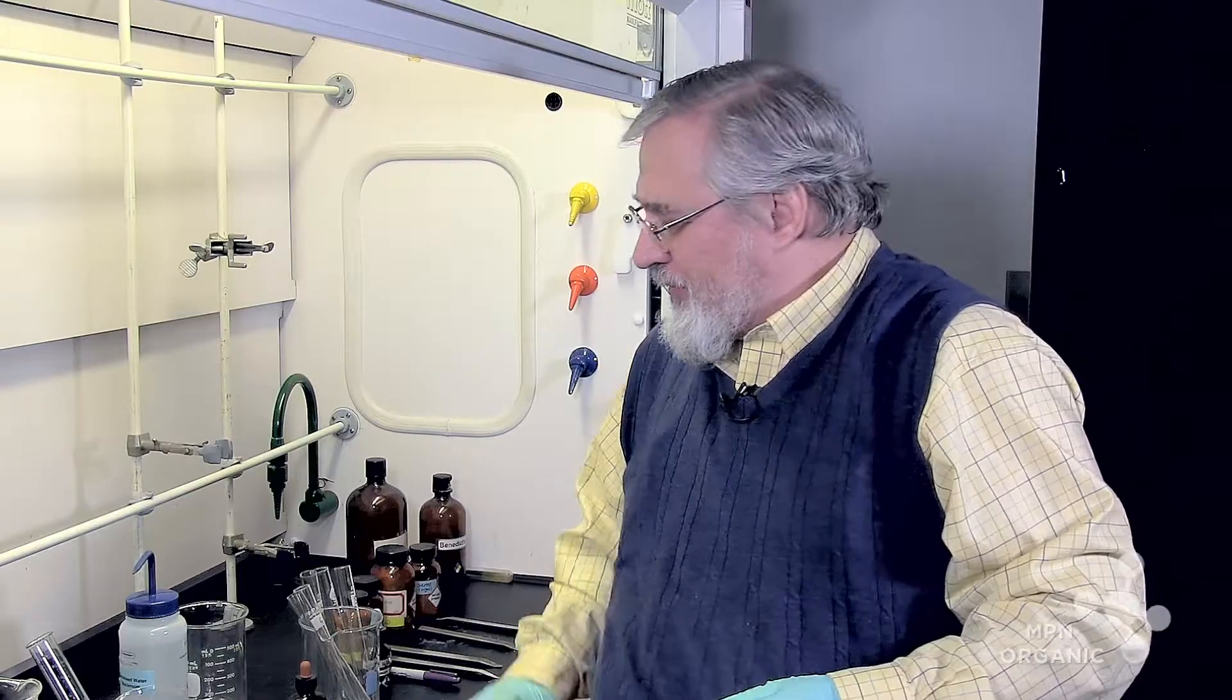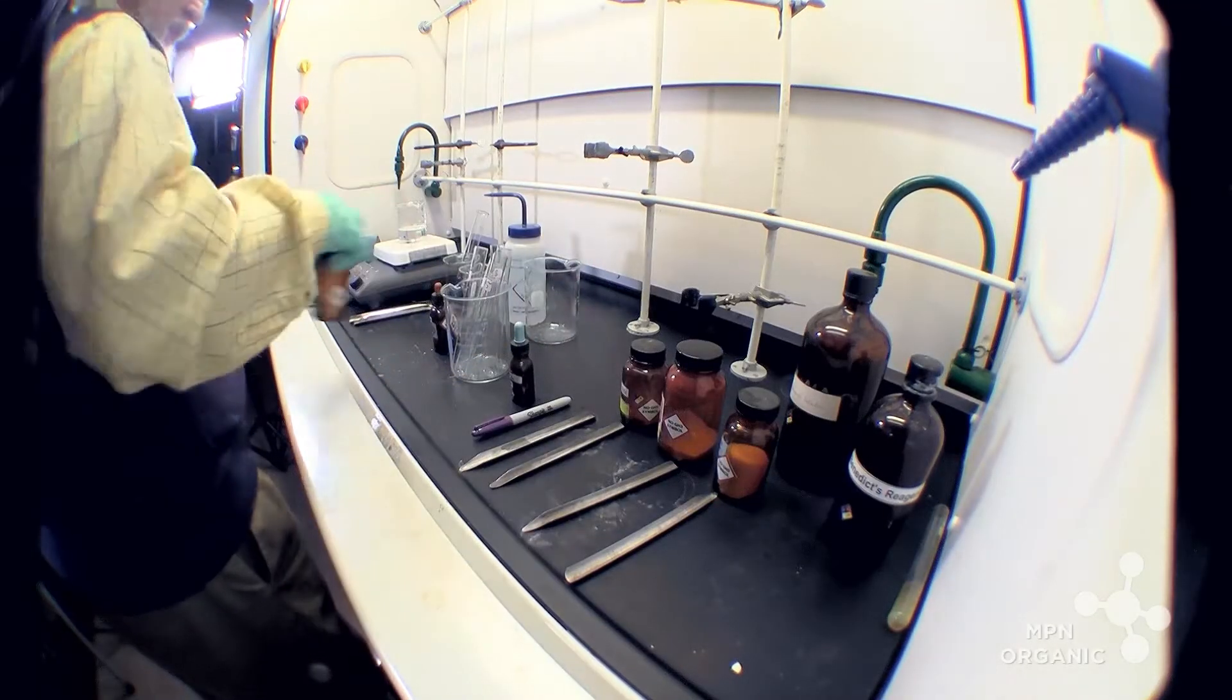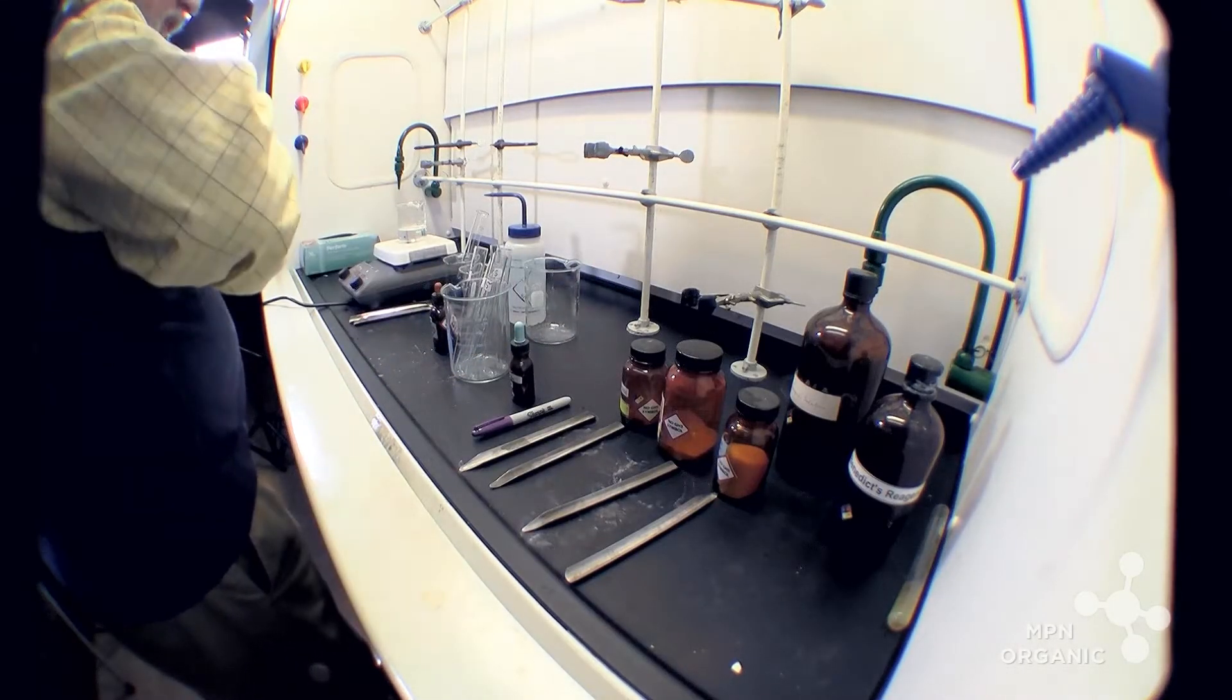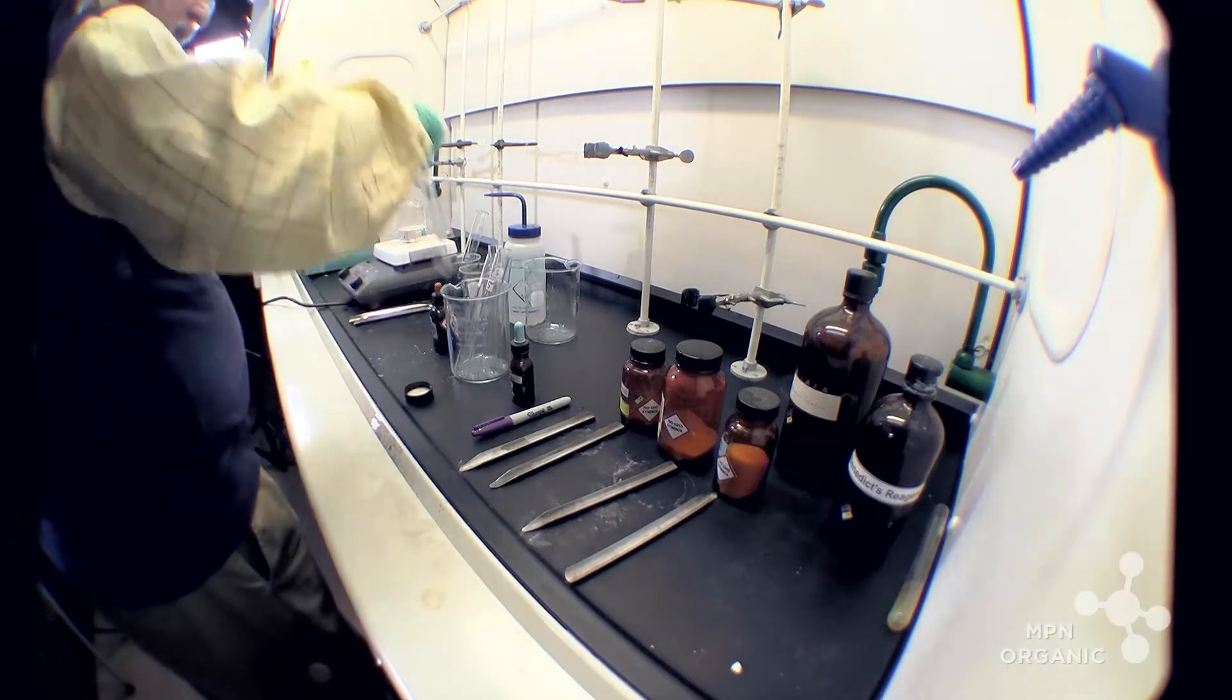We're going to be looking at this property of saccharides and disaccharides which we call reducing sugars. It's due to a structural feature within the saccharide itself which allows the title to be used - reducing or non-reducing sugar. I've got several sugars here that I took off the shelf of the chem department.